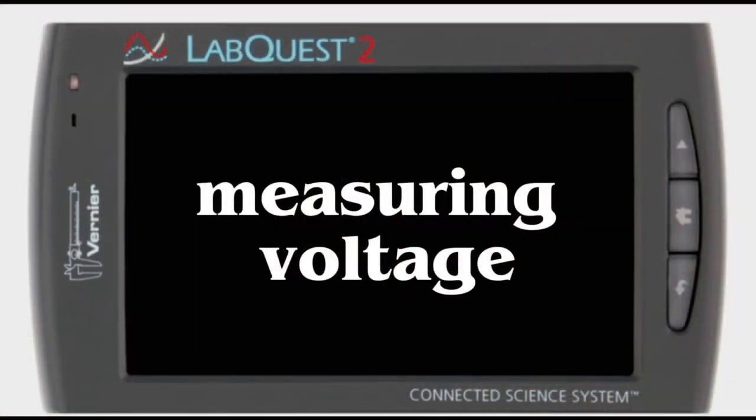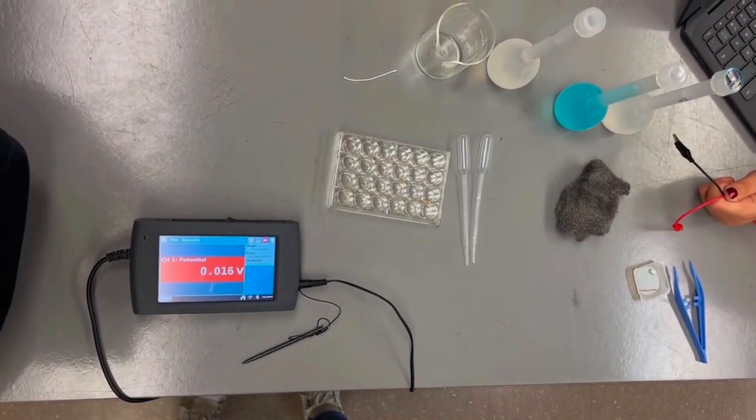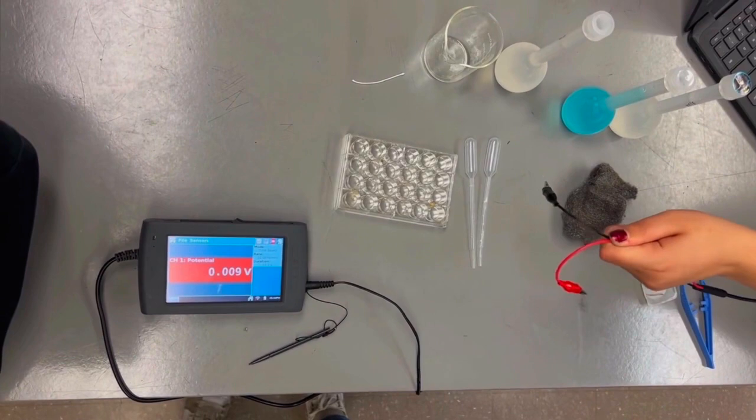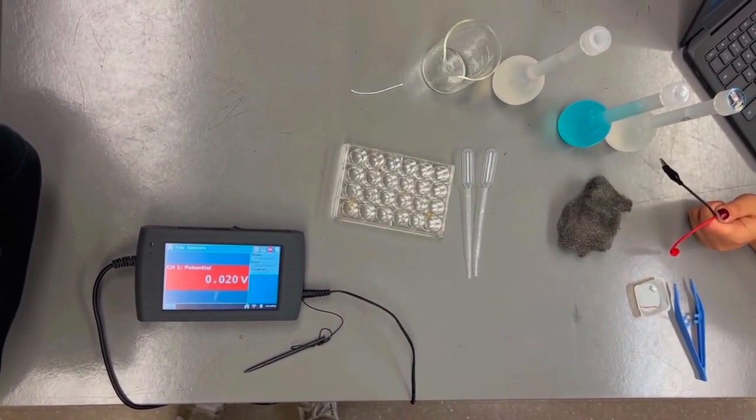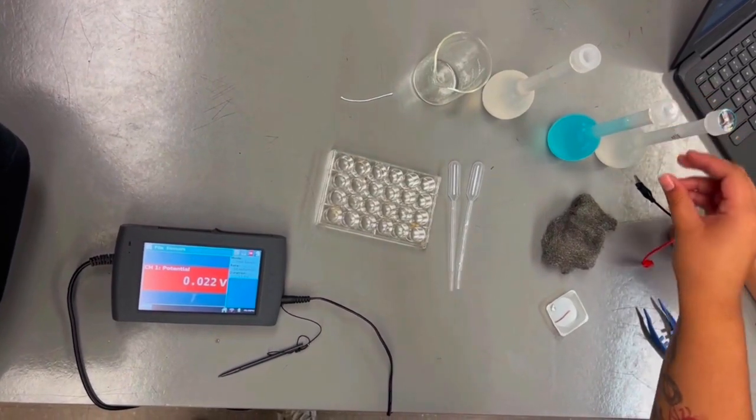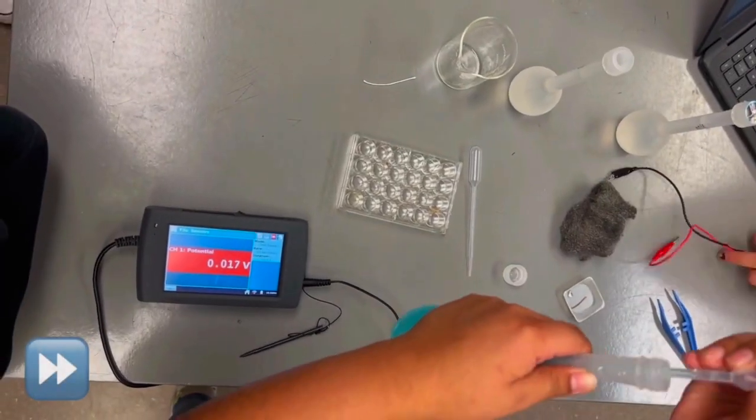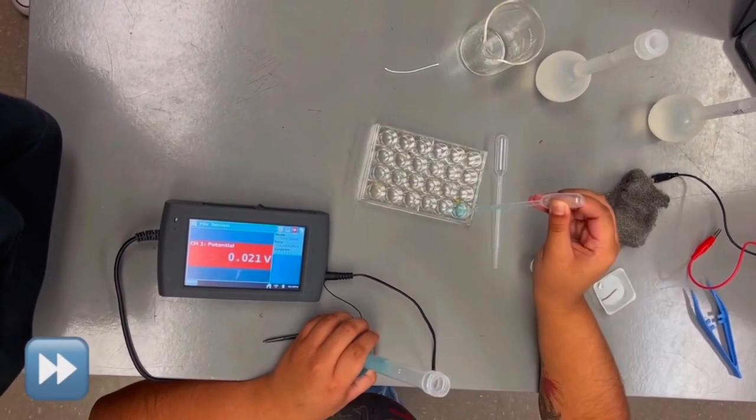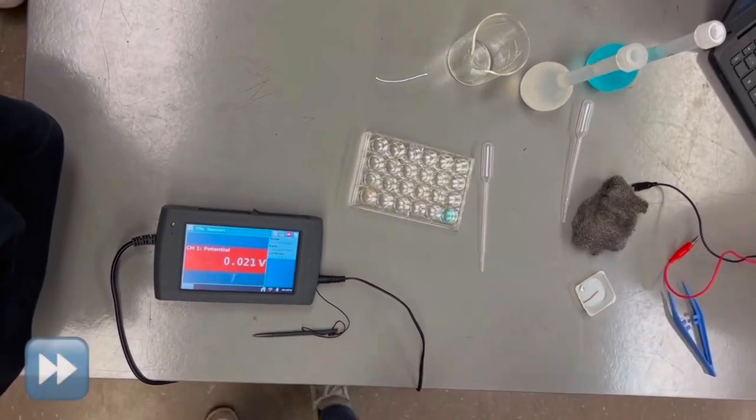The lab consists of three parts in which you will measure voltage using a voltage probe and lab quest. In this example, we will use copper and zinc electrodes along with their corresponding solutions, zinc nitrate and copper nitrate. Using barrel pipettes, transfer a few drops of each solution into adjacent wells on the spot plate.